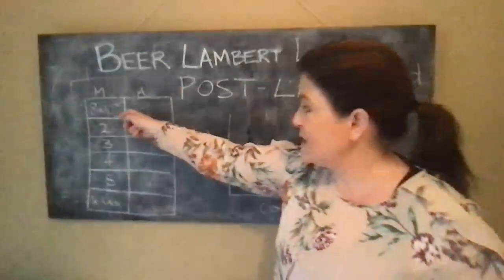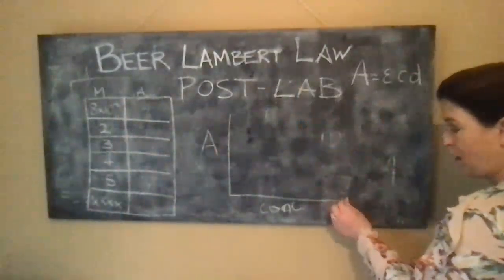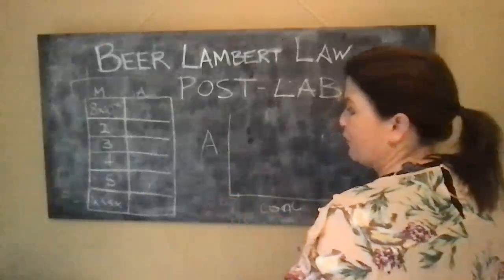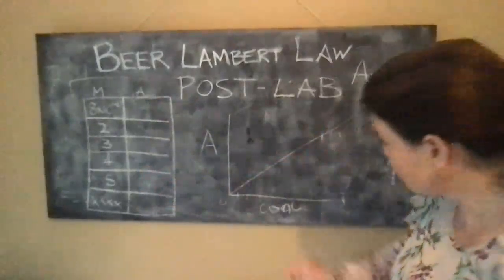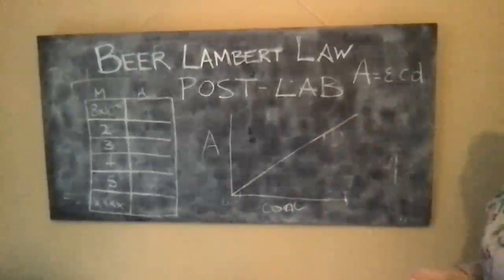And remember, this is our most concentrated solution, so our concentration for this will be the one highest up over here, and solution number 5 is the weakest. That's going to be the one closest to our 0 point. So if you map them or you graph them starting this way, expect your concentrations to be dropping, and they will. Now, okay, so we have a graph, and how do we use it?